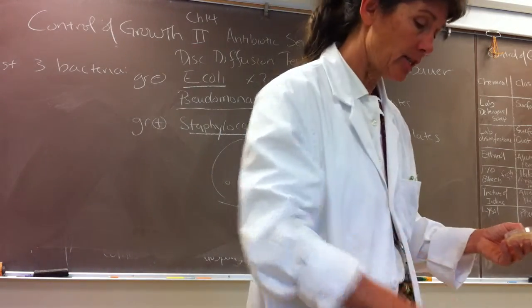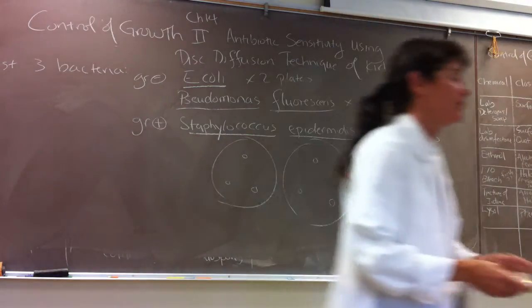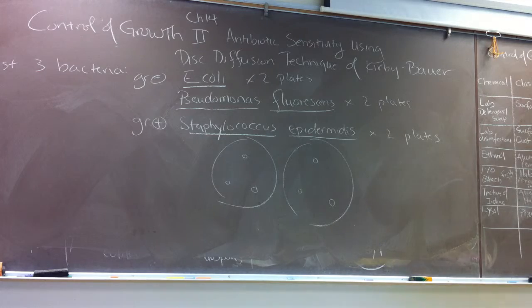The antibiotic disc stations, we've got 3 stations, 1 back here, 1 there, and 1 up here. So you'll take your plates over to the station, and the antibiotic discs are commercially prepared, and they're in these little plastic sleeves. Now some of the sleeves we have metal holders for them, and this is very nice because one of the challenges in getting these discs out is just getting the disc pushed out over the edge of the plastic sleeve. So I'll show you the more challenging way.